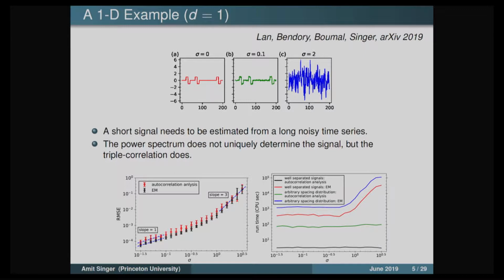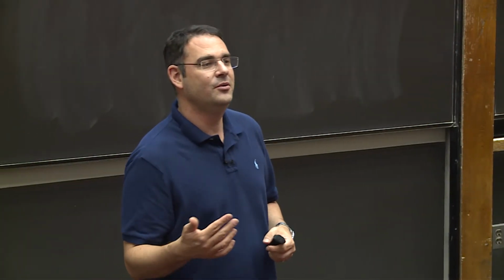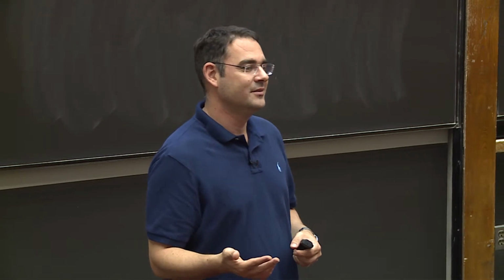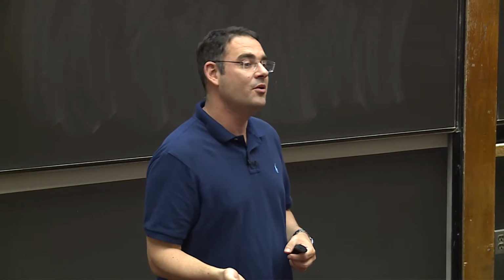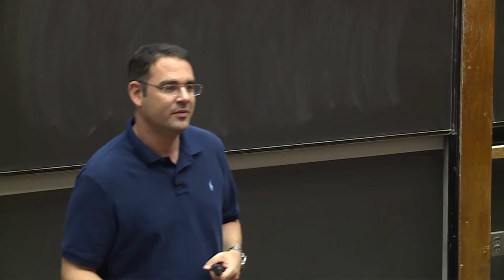Now, if we just stop at autocorrelations of order 2, it will not be sufficient, because phase retrieval in one dimension has no unique solution. So we need to go to autocorrelations of degree 3, basically the triple correlation function. And from the triple correlation, we can get the phases.